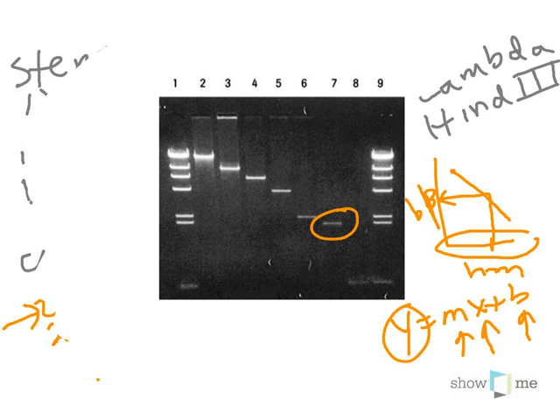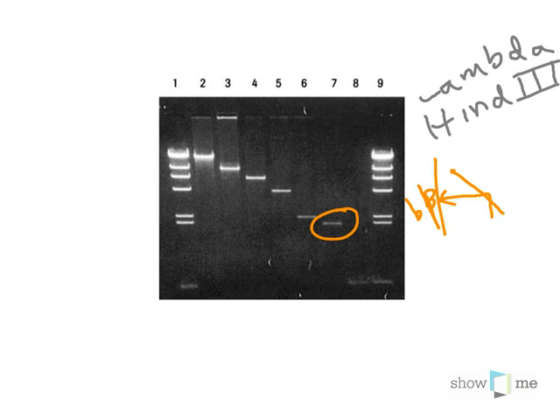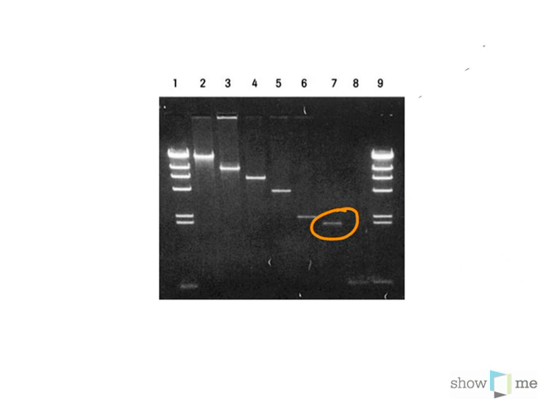So once you get the first step where you measure your control, your second step will be to generate a graph of that control. When you do that, you plot the points and then you measure the bands in your unknown.